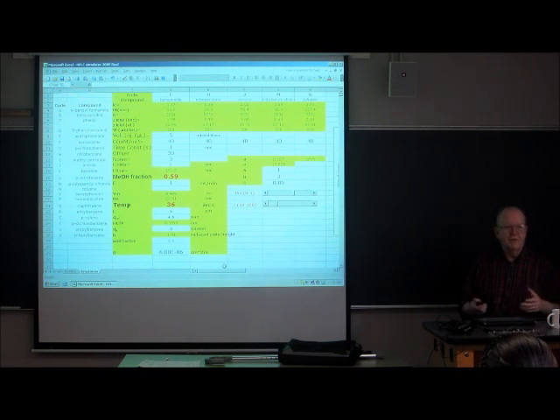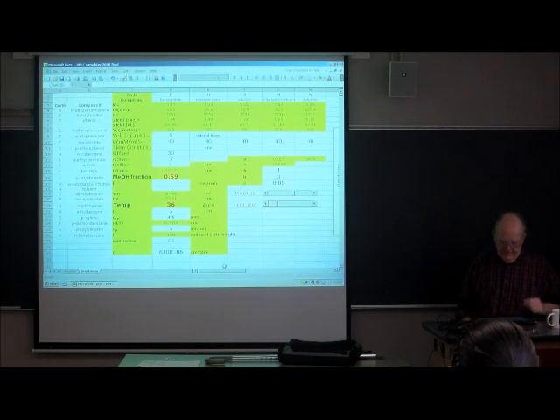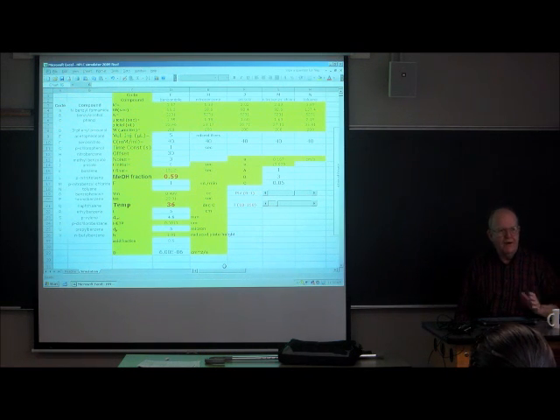You can change columns. You can go from one column length to another. You can't go from a 5-centimeter column to a 6-centimeter column, because nobody sells a 6-centimeter column. But you can here if you want to see what's going on. You can theoretically put in a particle size here of 5.11, but you can't buy 5.11 diameter particles. You can buy fives and threes and 3.5s, but we didn't make those discontinuous variables in this program.